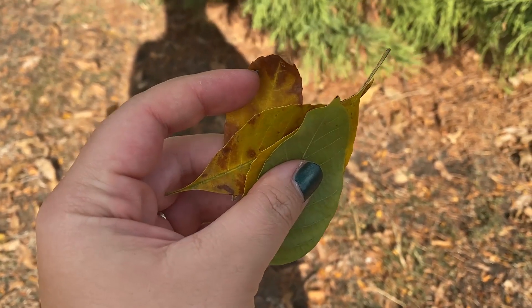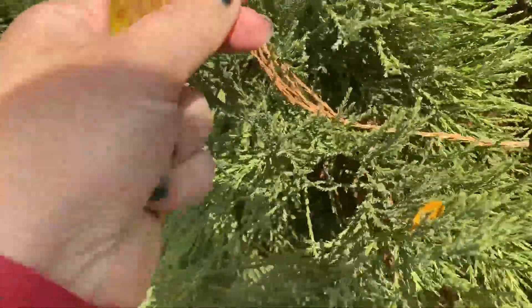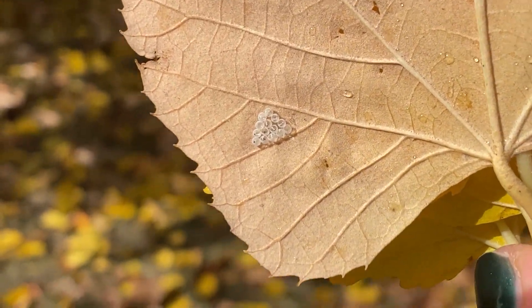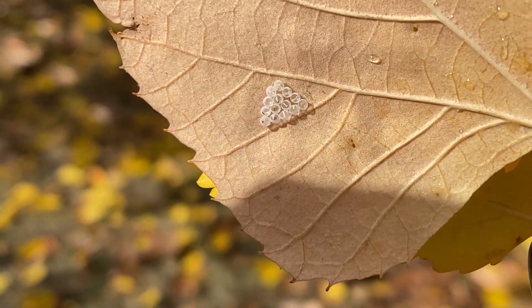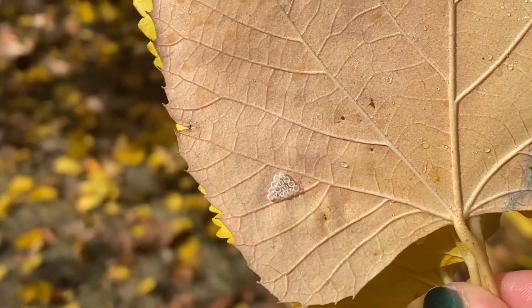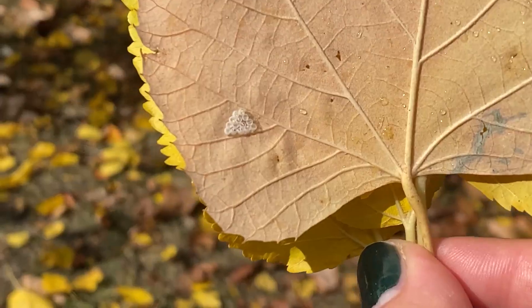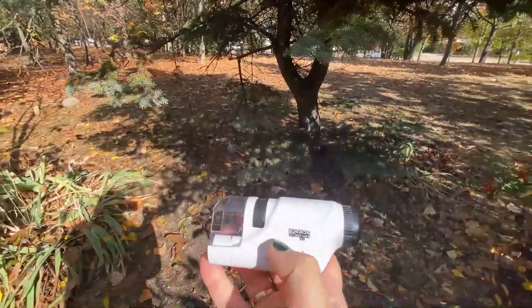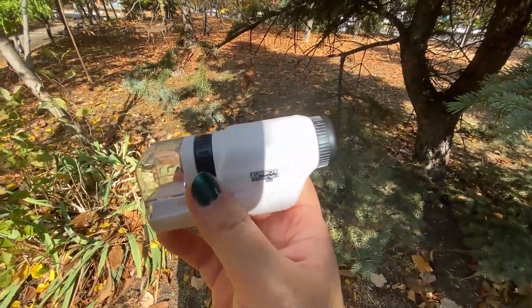I picked up some extra leaves that had more brown to them, but I'm also thinking of getting a sample from this other tree. While looking at this amazingly yellow tree I found a very interesting leaf — I believe these are eggs of some kind of insect, but they were already popped because there's nothing inside. This will be very interesting to look at under the microscope. And the great thing about this microscope is that you can use it directly here in nature — you don't need to gather samples and go home.